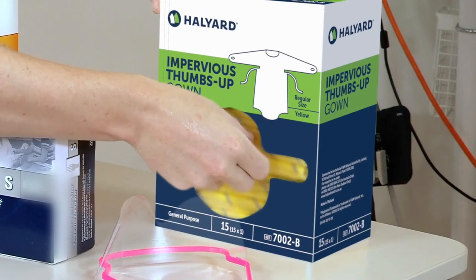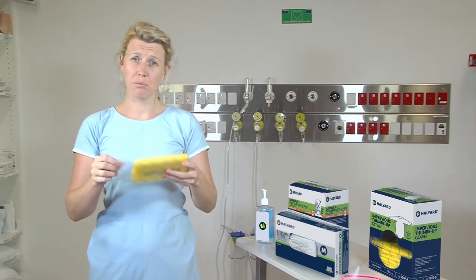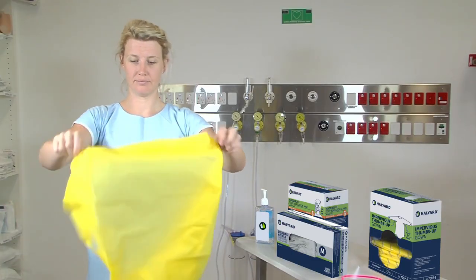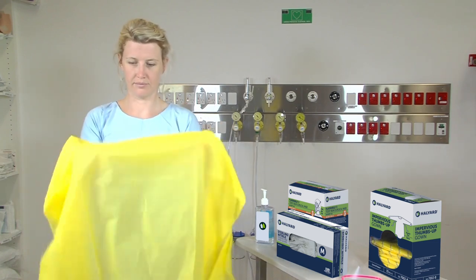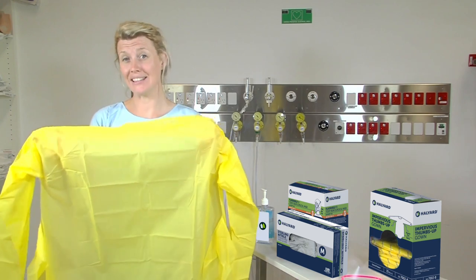The first item we're going to don is a gown. Ensuring that it's an appropriate size, remove the gown from its individual packaging. Open it up and apply it, ensuring it's fastened at the neck and at the waist.